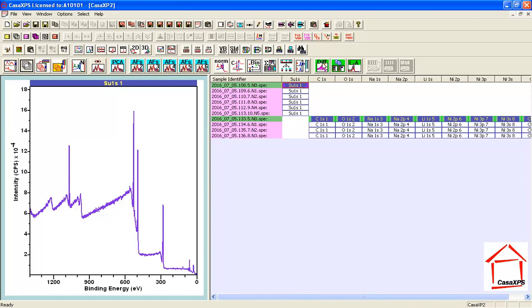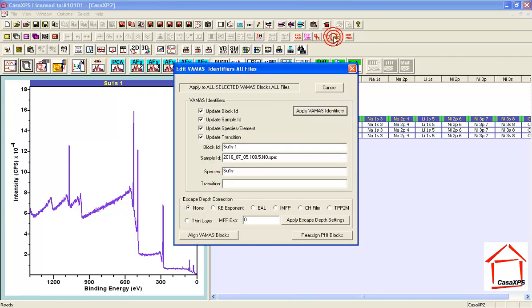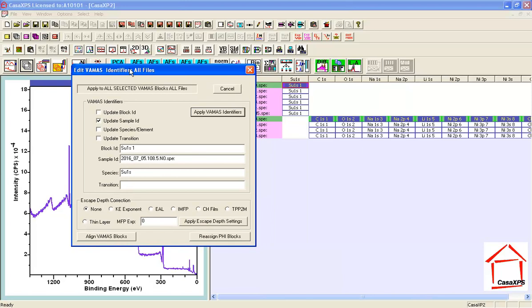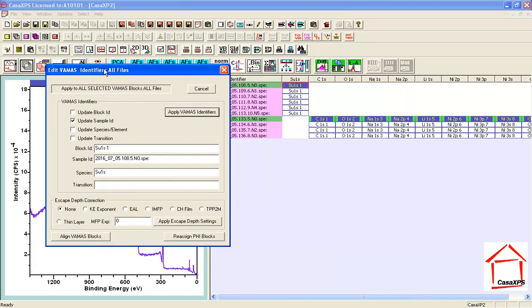So to make this adjustment, I can use the toolbar button that has the hint of edit sample ID. Now in reality, you can adjust more than the sample ID. The block ID, the element, and the transition for each one of these VAMAS blocks could also be adjusted.